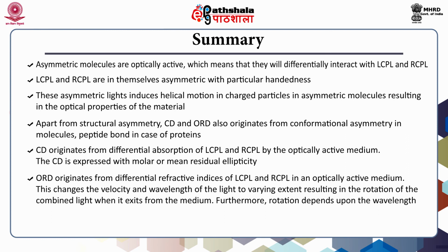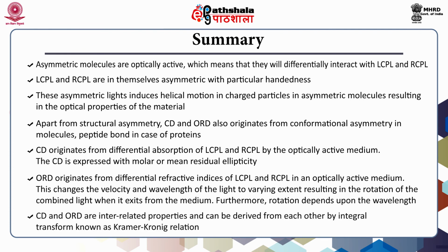This changes the velocity and wavelength of the light to varying extents, resulting in rotation of the combined light when it exits the medium. Furthermore, rotation depends upon the wavelength. CD and ORD are interrelated properties and can be derived from each other by an integral transform known as the Kramers-Kronig relationship, because the origin of these two optical properties is the same electronic system in an optically active medium.